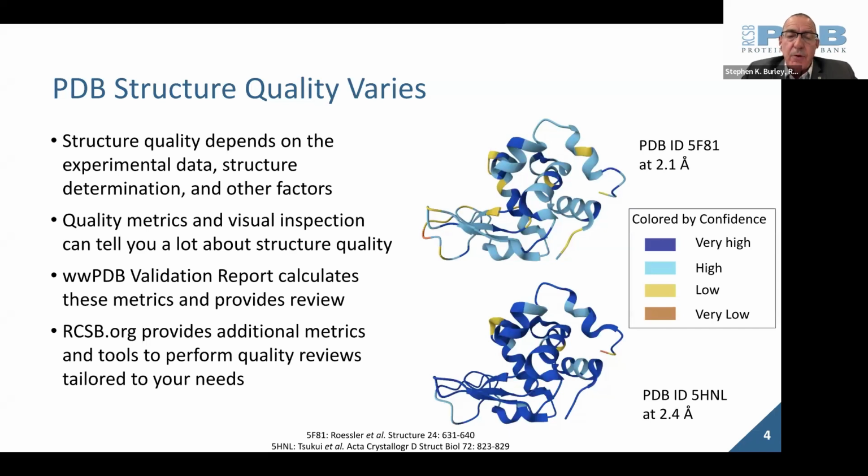It's important for you as PDB data consumers, when you do searches of the PDB and encounter not one, but multiple examples of the same protein structure, that you are aware of the tools that you can use to distinguish higher quality structures from lower quality structures, and focus your efforts, your understanding, your analyses, your experiment planning, your hypothesis generation on the superior quality structures.